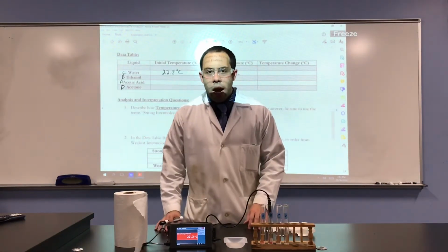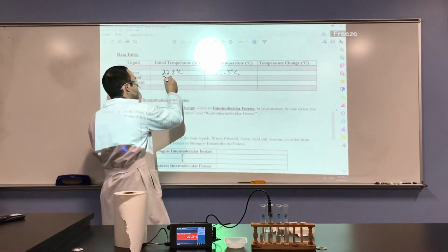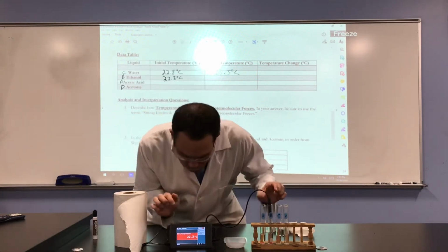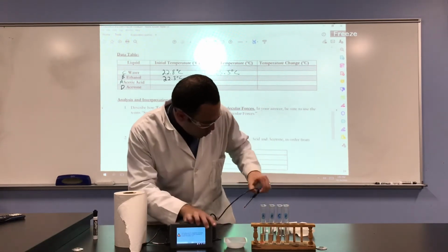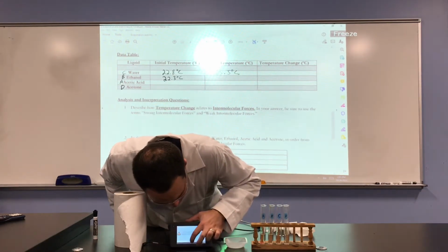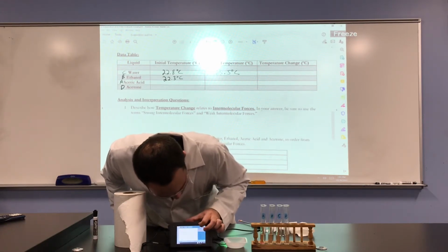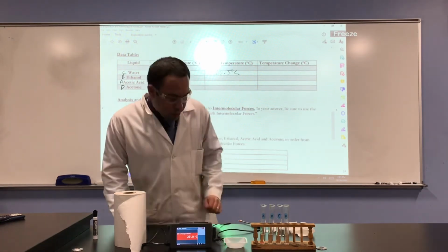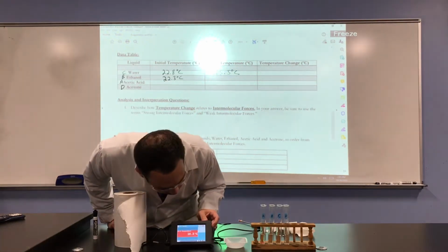All right, it looks like our ethanol temperature leveled out at 22.3 degrees Celsius. So that is our initial temperature. Let's remove the probe and click play at the same time. And put the probe at the edge of the lab bench. Let's discard our old data. And we already dropped down to 20.3, 20.2. And we'll go again for 3 minutes.